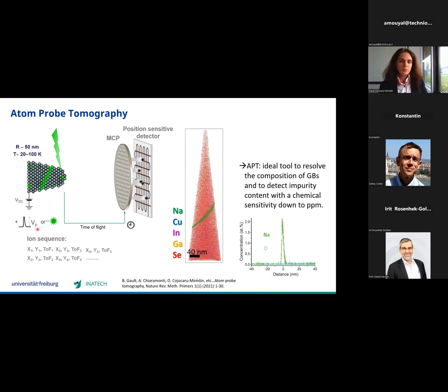What we apply in addition, and this is crucial for the atom probe, and basically this defines the two modes in which the atom probe can be used, is electric pulses or laser pulses. I schematize here with the laser pulses because I'm mainly working with semiconductor materials, and they require, of course, a laser, as voltage pulses will not be sufficient.